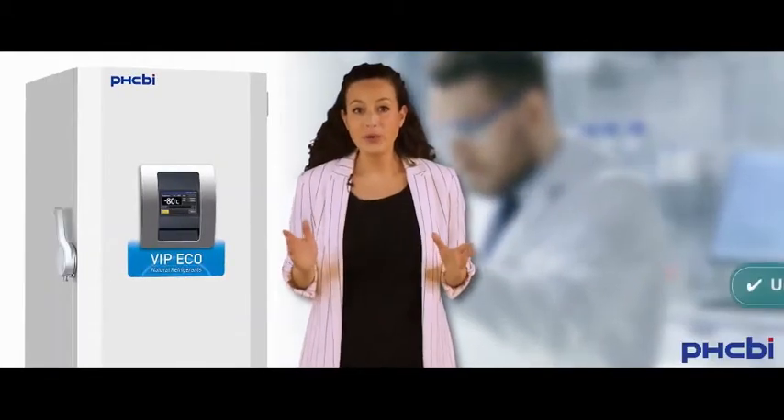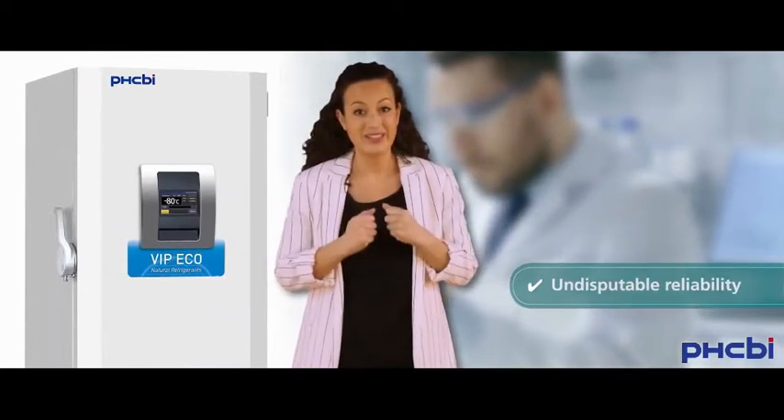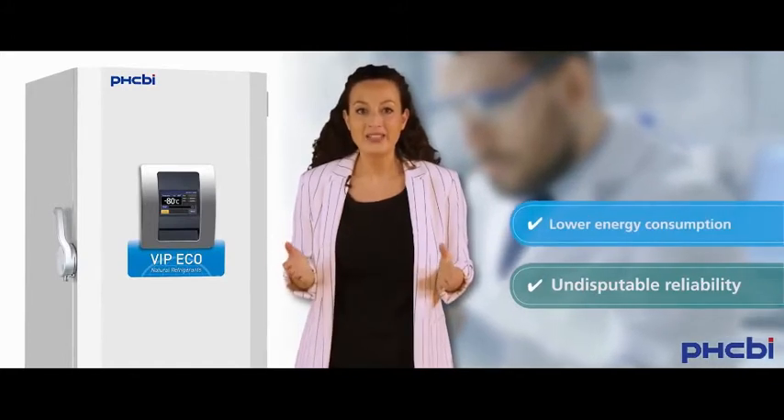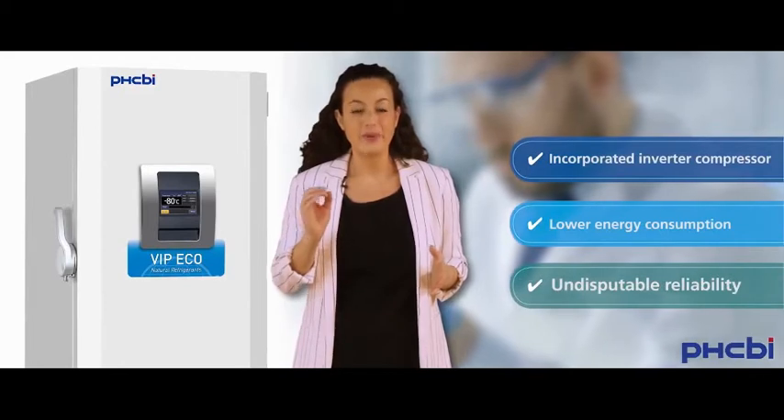First of all, the model still has the undisputable reliability of the compressors at its heart. But now, it offers lower energy consumption as well, thanks to the inverter compressor that we've incorporated.